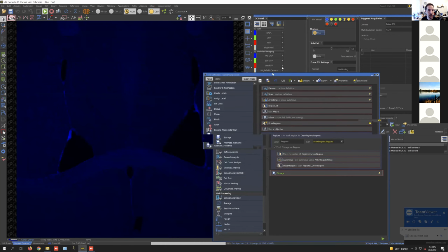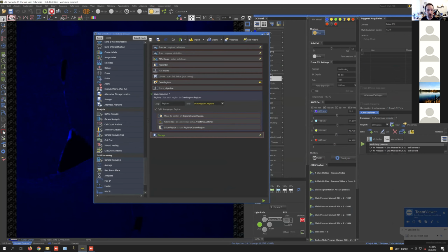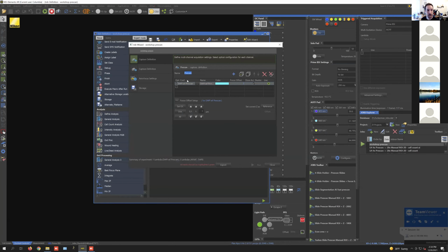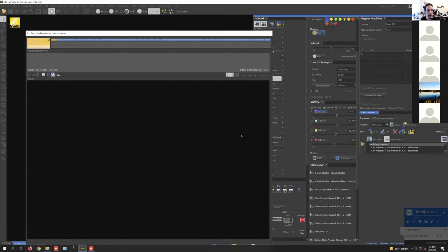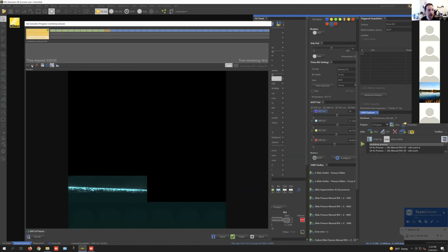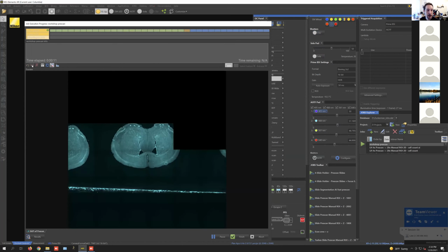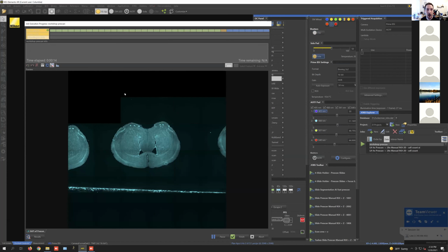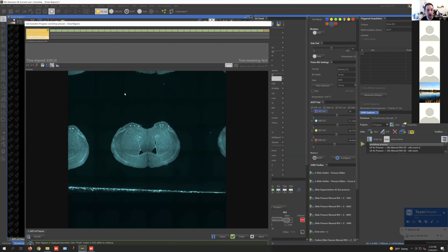Okay, so we have a live image here. We're in the middle of the tissue section. So if we run this, and if you can't see what's happening, we can just say auto scale here. This button here will just scale to the brightest pixel in the image. And you can see, with the 4x objective, even without any overlap, we're getting a nice image here where we can really clearly see the tissue. And because we're imaging with wide field, even if it goes out of focus slightly, we're still going to be able to see the tissue quite clearly.